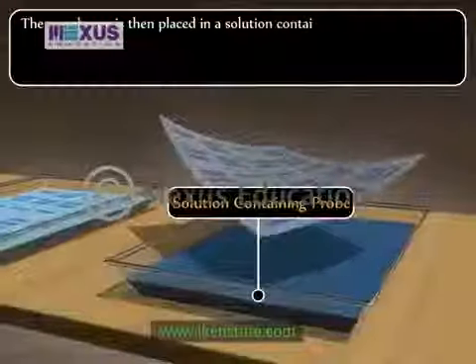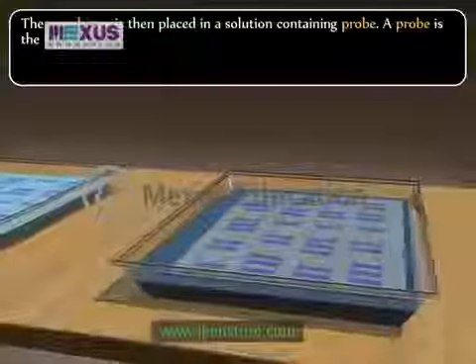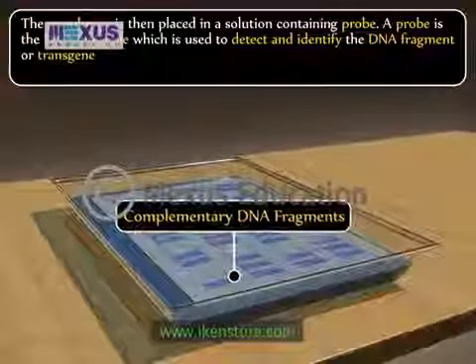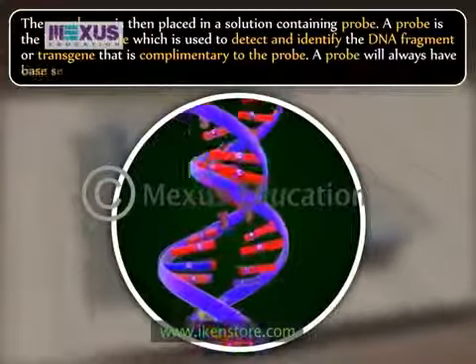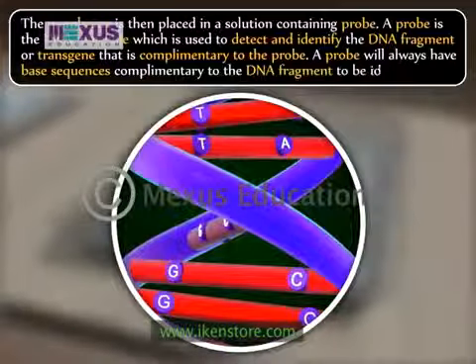The membrane is then placed in a solution containing probe. A probe is the DNA molecule which is used to detect and identify the DNA fragment or transgene that is complementary to the probe. A probe will always have base sequences complementary to the DNA fragment to be identified.